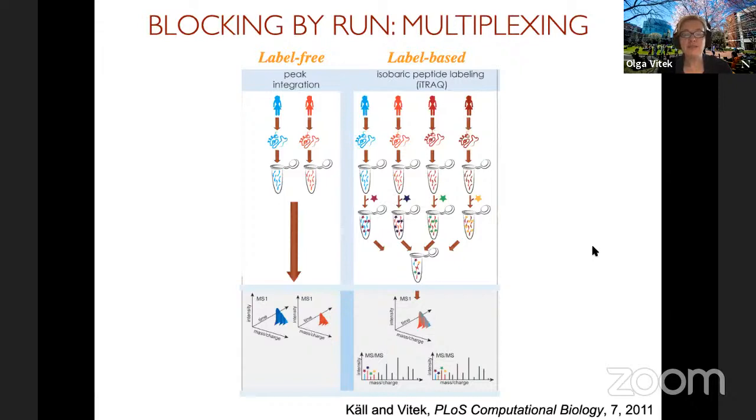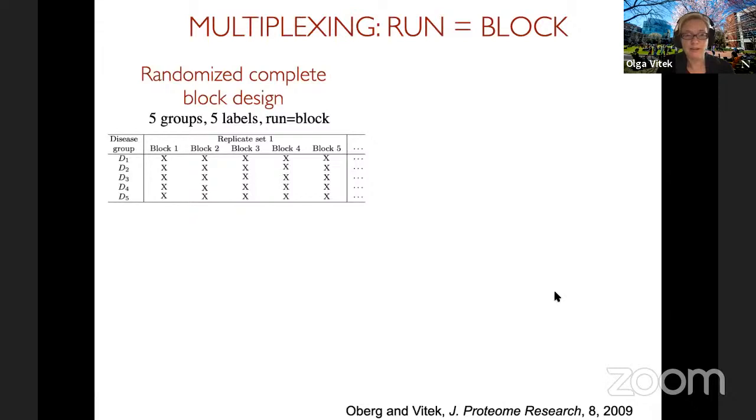But this said, just from the pure statistical perspective, if the experiment can be done effectively, this allows us to reduce the unwanted variation, which comes just from the differences between mass spectrometry runs. So this is potentially a very good thing if it is done well.